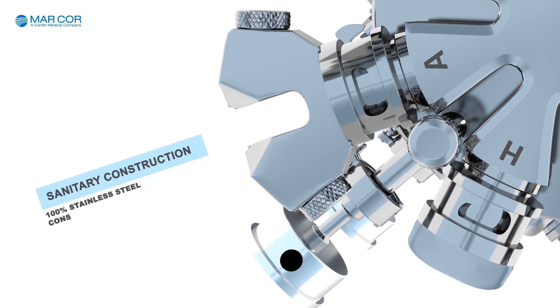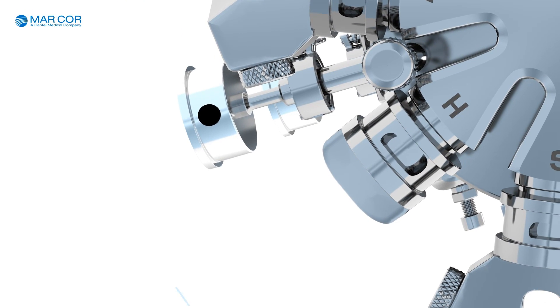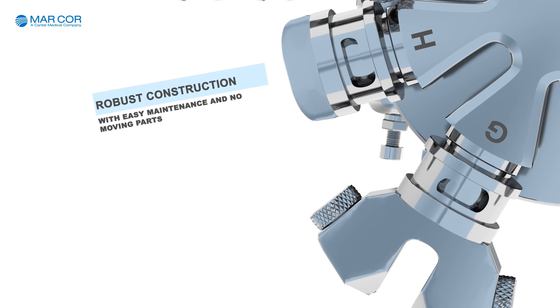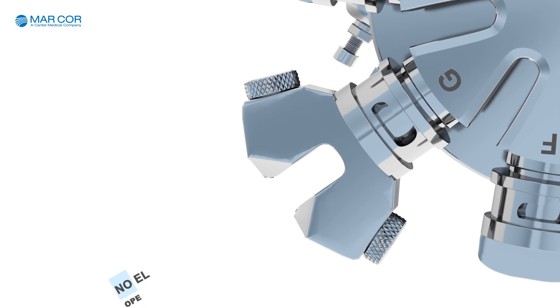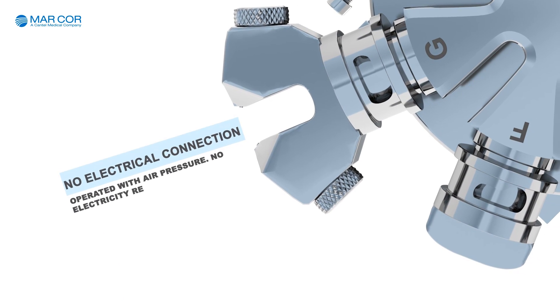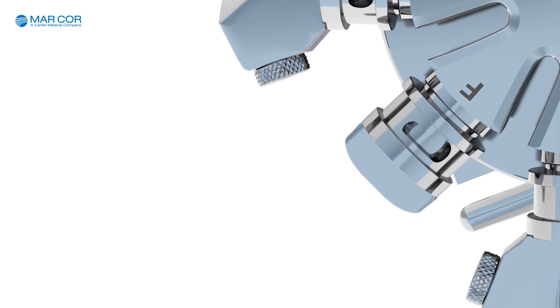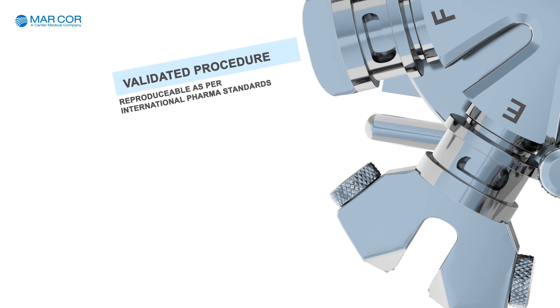Dry Fog 2 features a fully sanitary design with 100% stainless steel construction. Very easy to maintain with no moving parts and operates with only compressed air. Validated procedures, reproducible as per international pharma standards.